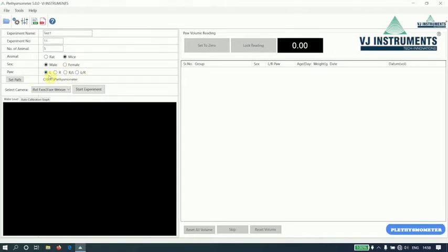Select L for left, R for right, and R slash L if you are going to perform first right then left, or L slash R if you are going to perform first left and then right paw.